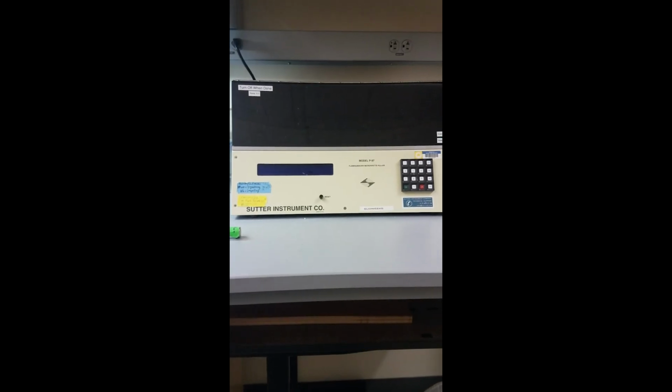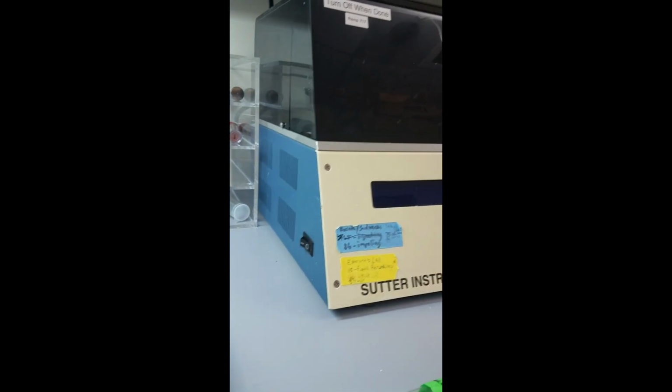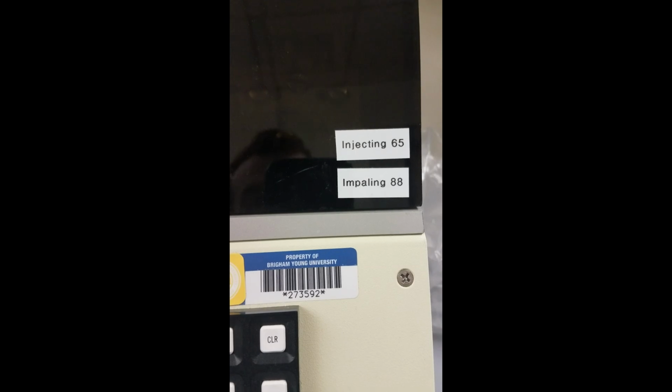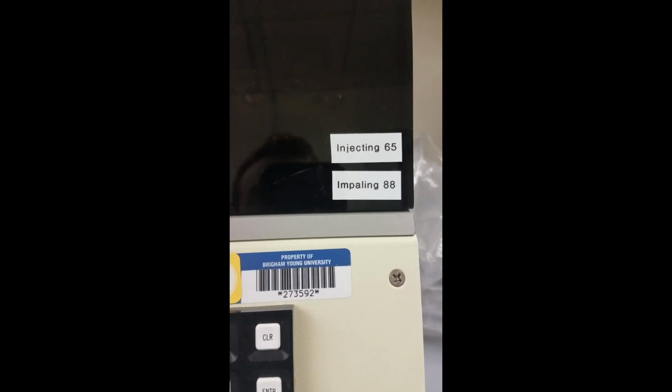How to pull more tips for injections. This is the machine that you will use for pulling those tips. The on-off switch is here on the side, so we're going to turn it on. Over here you have labeled what program you have to use for injections or impaling. We're going to pull injection tips.